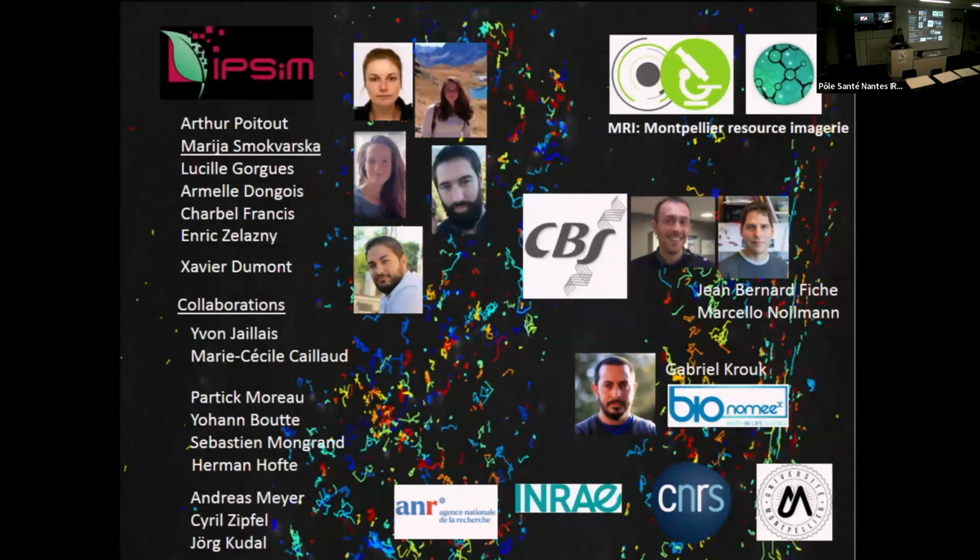No, well, it's interesting. I did TIRF even when I was a postdoc, even before coming back to France, on plant samples. And indeed, all the people that you will talk with will tell you this will never work because of the cell wall thickness. What I would guess is, well, it's a question for you and not for me. It's working, we are sure about that, but maybe one thing that might happen is that the cell wall might have the same refractive index as the glass, I wonder, and maybe the evanescent wave will then form at the membrane. But you're sure you're in TIRF? You're not doing just HiLo illumination?